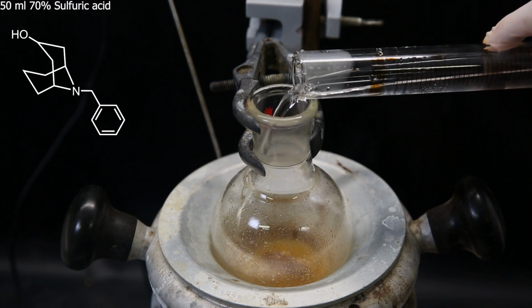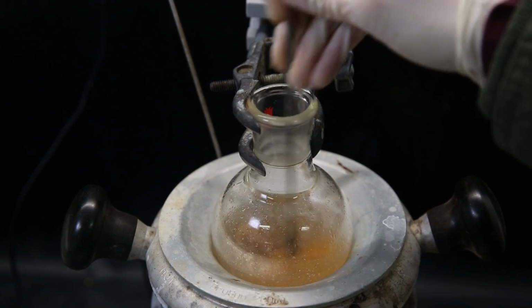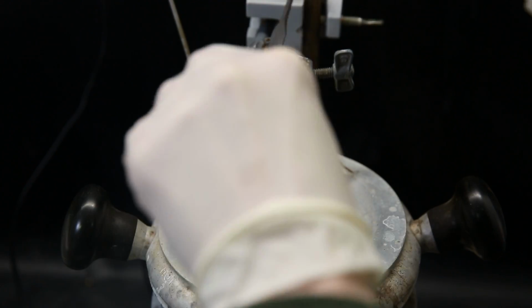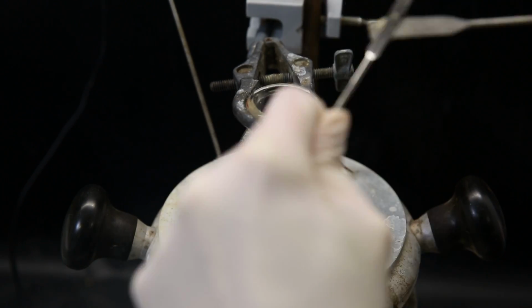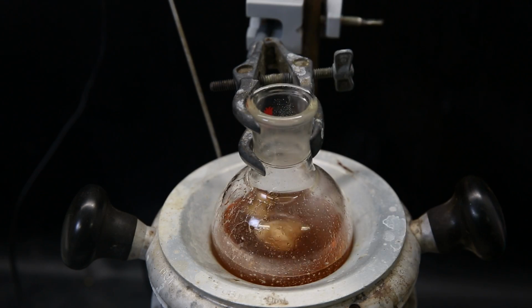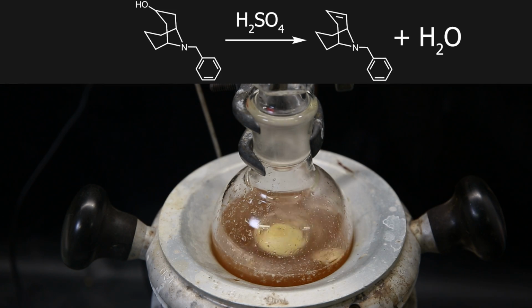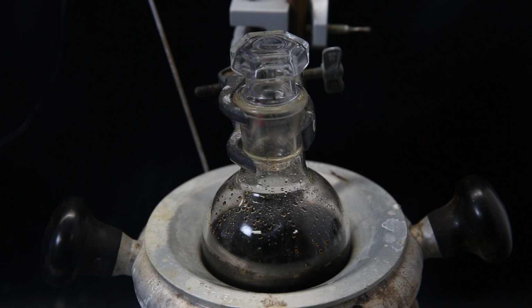Then for the next reaction, I add in 50 ml of 70% sulfuric acid and heat it to 100 C. I loosen it with a spatula to get it to stir and make everything dissolve. Afterward, I add 50 ml more of the 70% sulfuric acid and stopper the flask. I then leave it to stir for a day. This reaction is a simple dehydration reaction, where the hydroxyl group will protonate and leave as water, causing the formation of a double bond. When I come back, the mixture has turned black and the reaction should be finished.